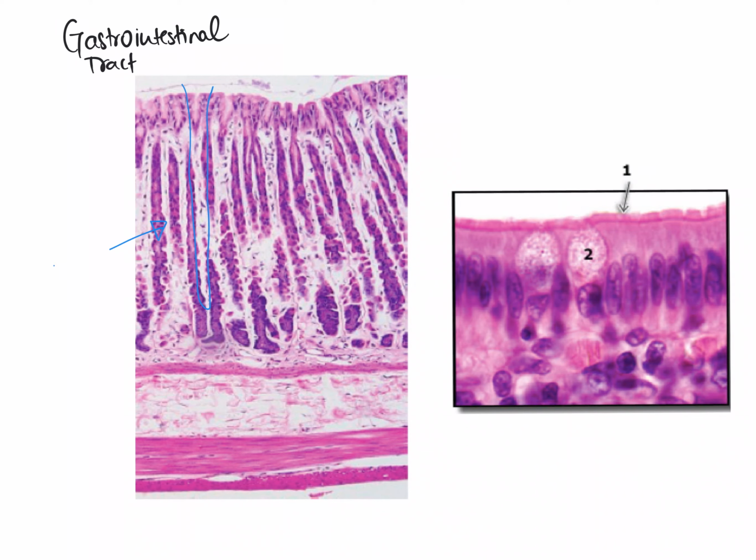So here we can see the epithelium, and because we're in the stomach, this layer forms invaginations or gastric pits that sort of fold inwards. As I said on the slide previously, underneath the epithelium we always have the lamina propria, and this thin, really pink layer is the muscularis mucosa.